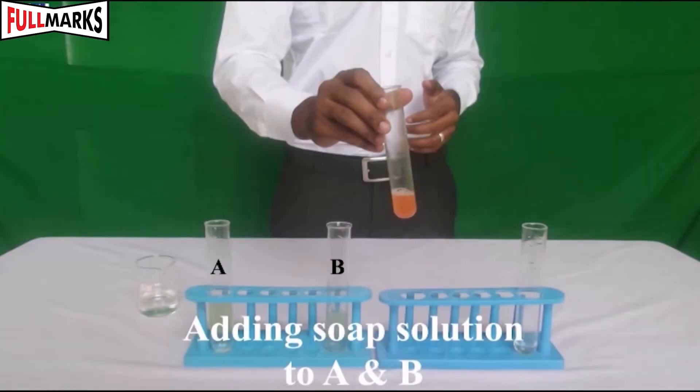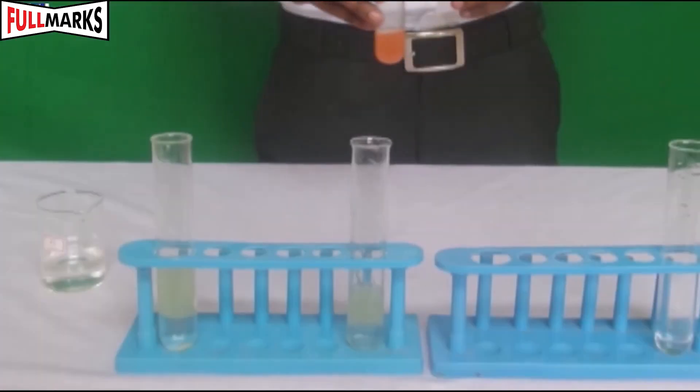Label it as B. In both test tubes, add a few drops of soap solution.